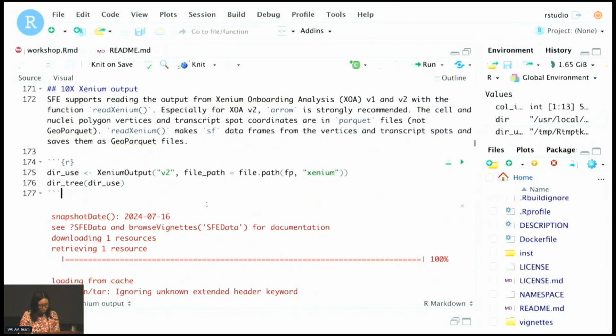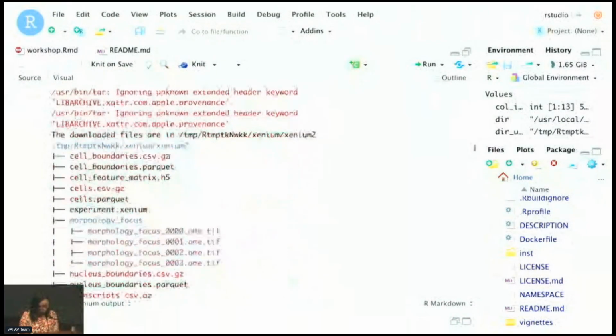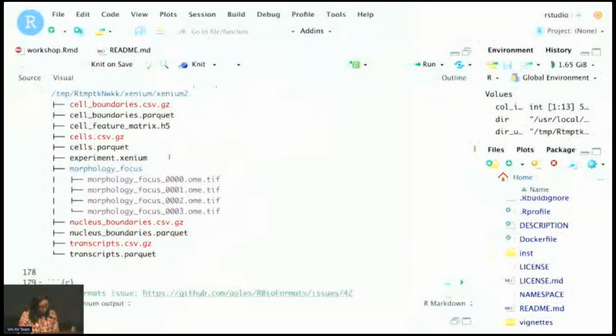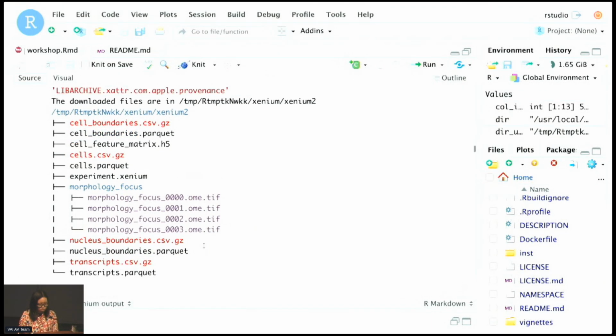Here I'm reading one from V2. This is what the output structure looks like. We have cell boundaries, that's for cell segmentation polygons, and we also have nucleus segmentation polygons. For XOA V2, unlike V1, the segmentations are greatly improved, and V2 will allow multiple nuclei in each cell.